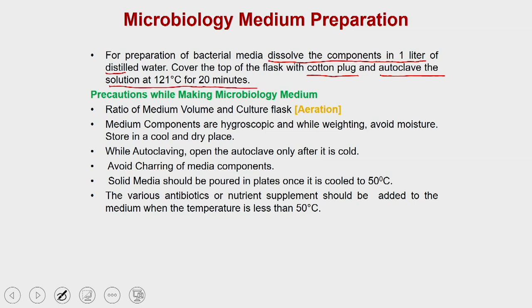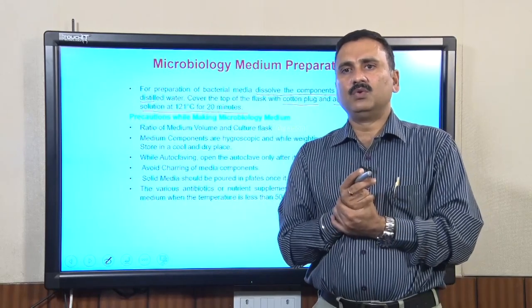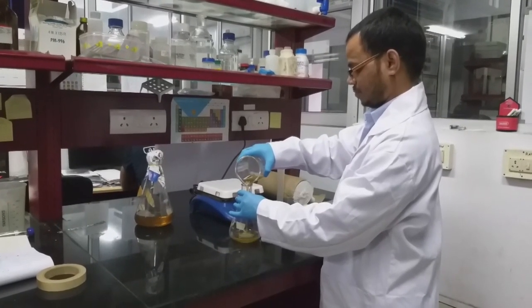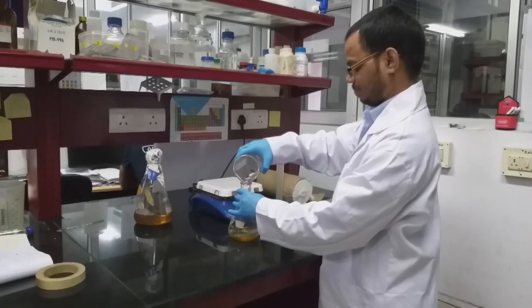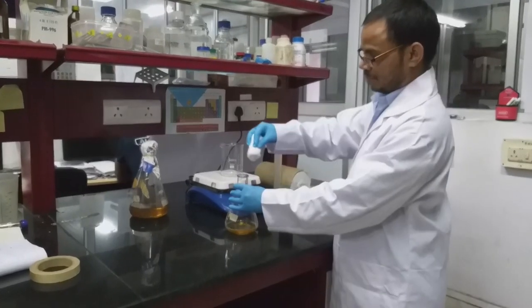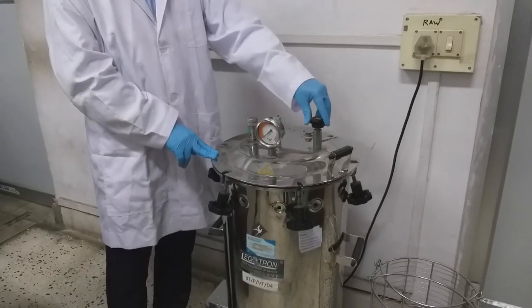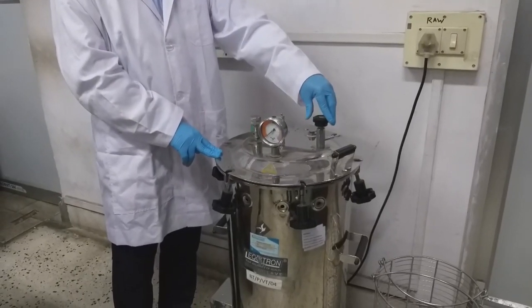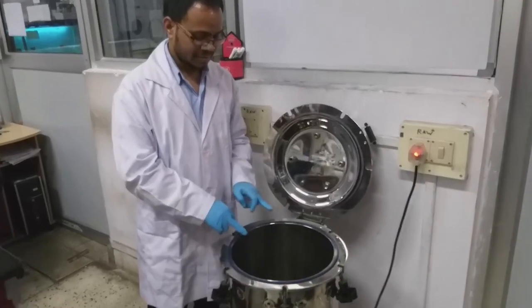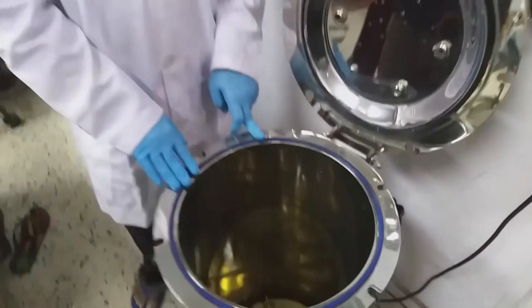And here we have prepared a very small 10 minute clip for you to show the different steps in detail. This clip was prepared in our laboratory to demonstrate how to prepare a microbiology media. It was prepared by one of my students, Suram Banesh. What you will see is that Banesh explains many aspects of preparing the microbiology media as well as the different precautions you should take.